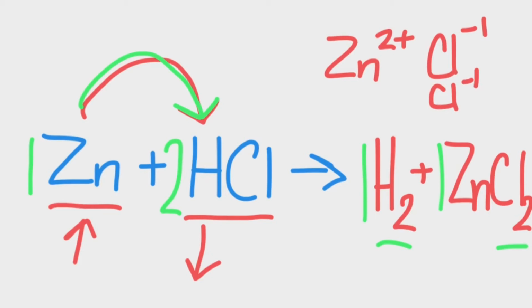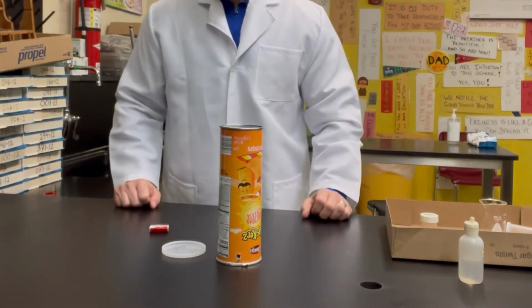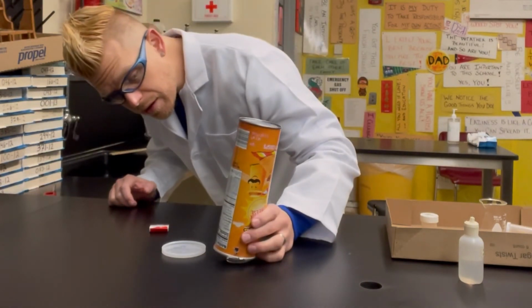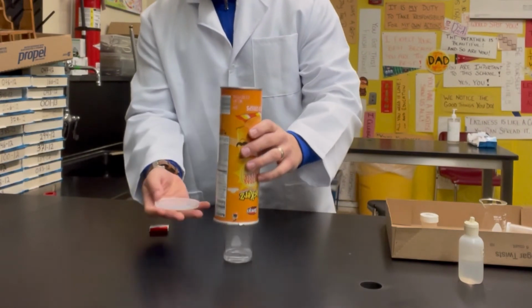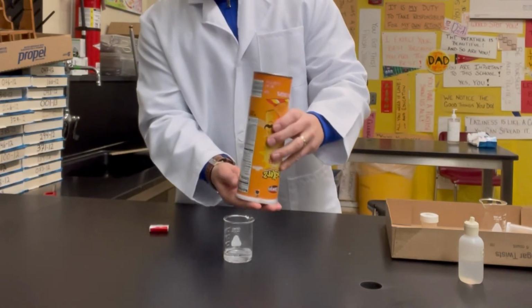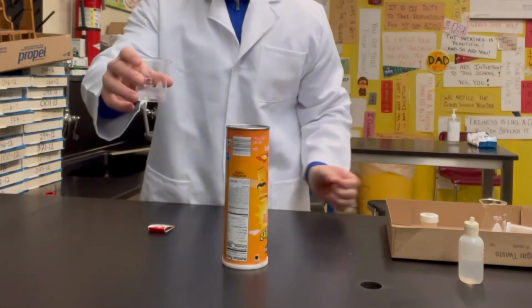All right, back to the reaction. Let's see what happens. So we've been letting the hydrogen gas build up inside the chip can. I'm going to take a look. See, it looks like the hydrogen gas has been building up. So what I'm going to do is take my chip can, put the lid on it, and move this far away.